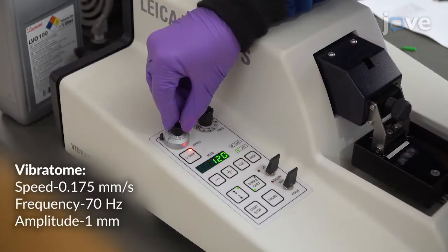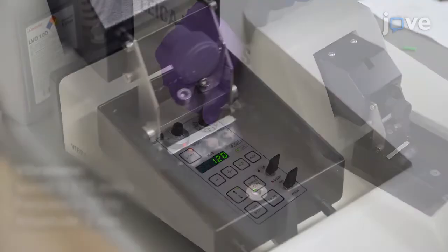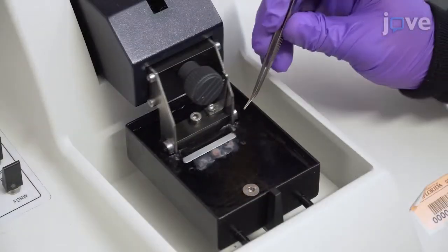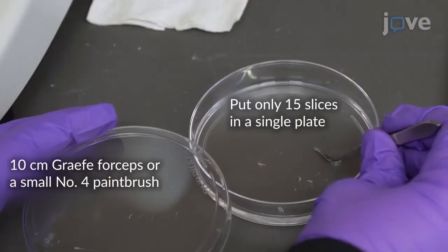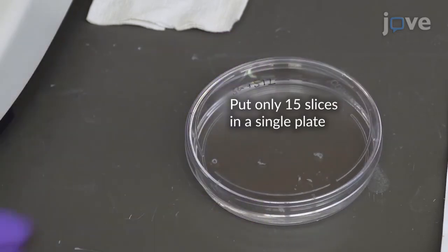Set the vibratome to make slices of 120 micrometer thickness and start it. Then observe the slices coming off the tissue blocks. Lift the slices when they float off the block by placing a paintbrush or forceps below them, and place the slices in Krebs ringer bicarbonate buffer containing 3 mmol D-glucose and trypsin inhibitor.